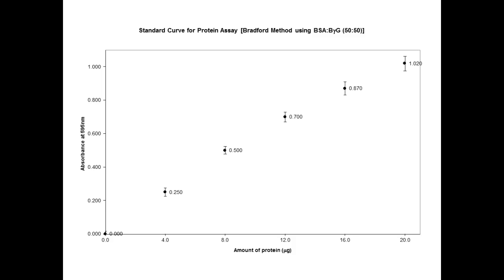And again, in this class, we're not going to go to this level currently, but we are working on getting the technology and the equipment where, when we run one of our tests, we could actually quantify it instead of getting a yes or no. So this is an example of a test well plate where there's 96 tiny little wells, almost like 96 little test tubes, that scientists can run tests in. And a lot of the tests that we run will produce a color change, or you'll have turbidity that can be measured by a special spectrophotometer.